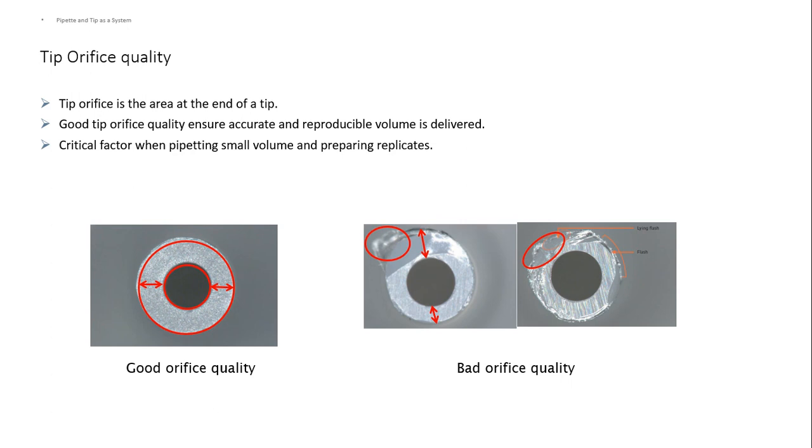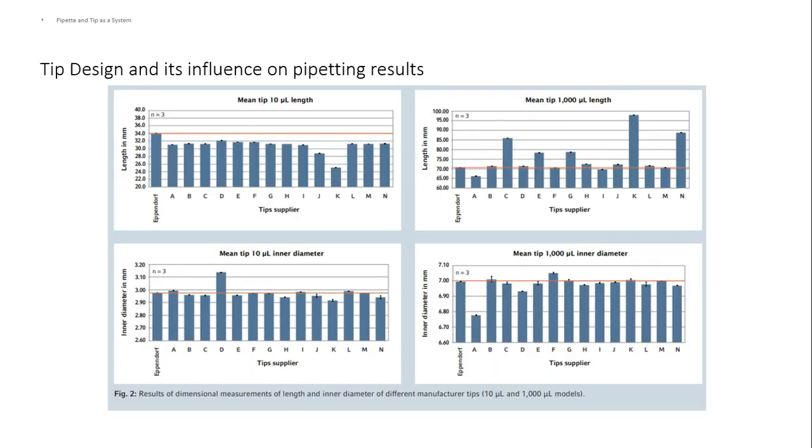We go to the next slide. The idea of this comparison is to clarify that not all brands of pipette are compatible with other brands of pipette tips. My Eppendorf pipette or Thermo Scientific pipette may be compatible with only selected pipette tips.